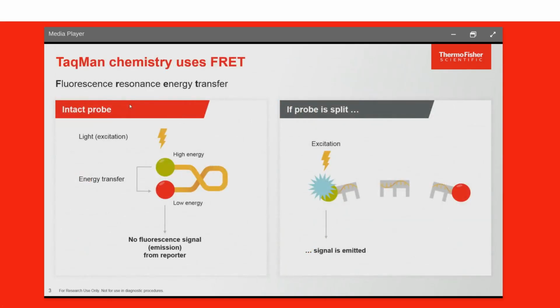Before we jump into the meat of the presentation and navigate the Thermo Fisher website to find these different products and tools, I think it would be wise for us to have a brief level set on what TaqMan chemistry is and how it works. So to fully understand TaqMan chemistry, it's important to understand the concept of FRET. FRET stands for fluorescence resonance energy transfer.